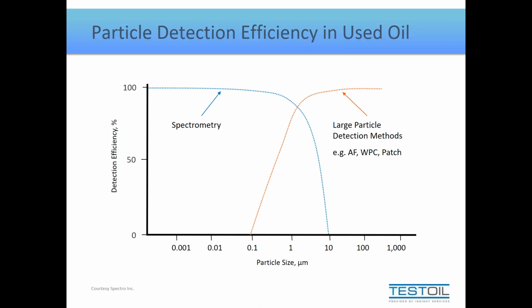There's no set value as to when too much water becomes a problem. Some fluids like water glycols contain 46% to 50% water routinely, and they can be measured via elemental spectroscopy. Whereas there's other samples that are not meant to have water in them, and concentrations of a couple thousand parts per million can skew the results significantly.